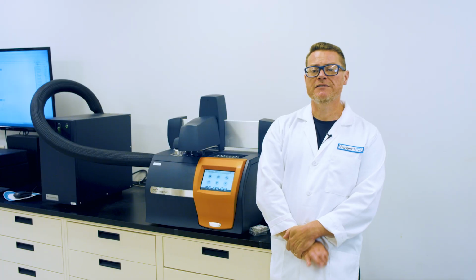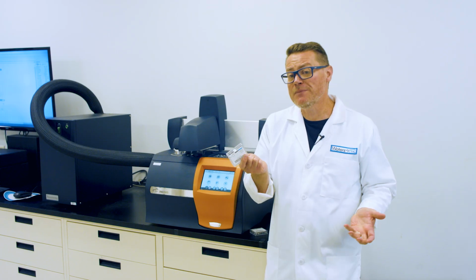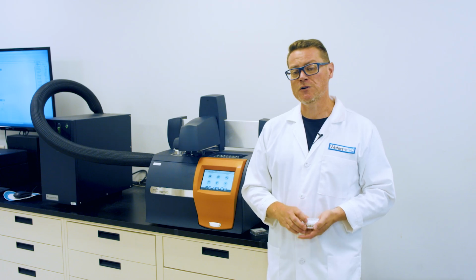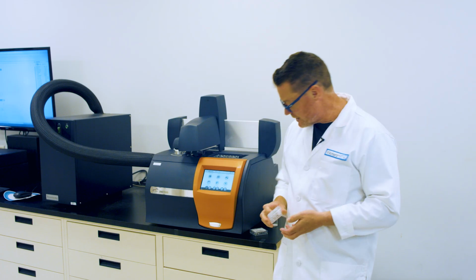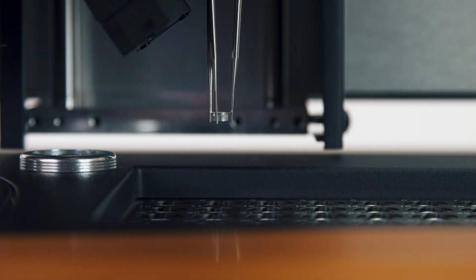The sample and reference materials are encapsulated in pans. Pans come in different sizes and can be made of different materials, depending on the temperature to which you will heat them. In the pharmaceutical world, we typically use pans made of aluminium. Aluminium is light and conducts heat very well, so it's an ideal material for use in a calorimeter.